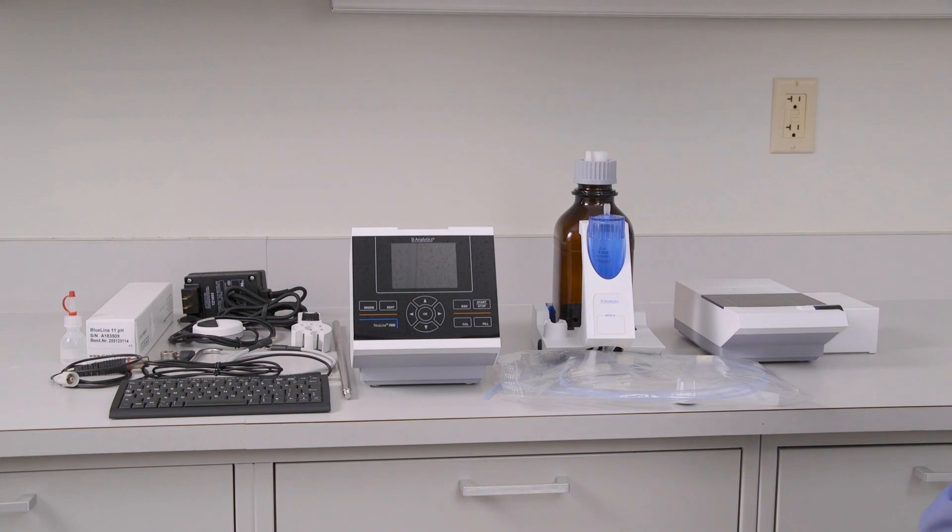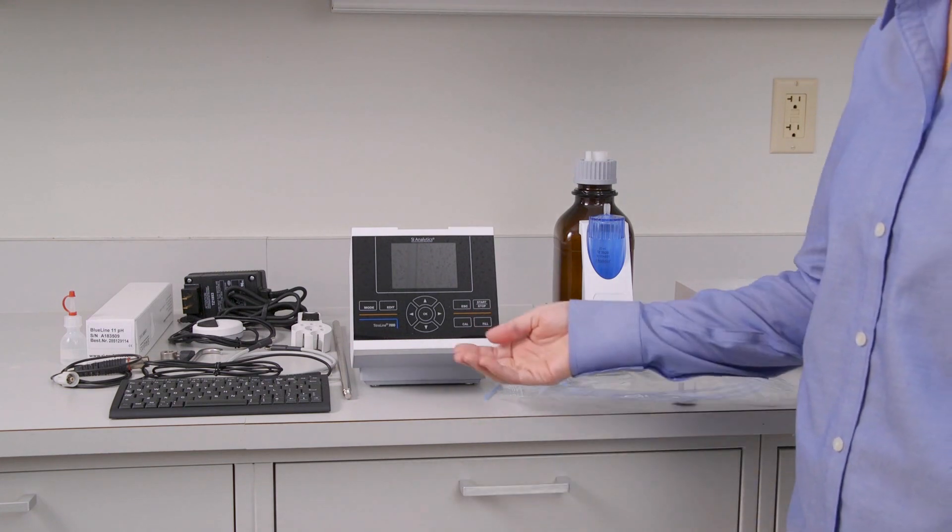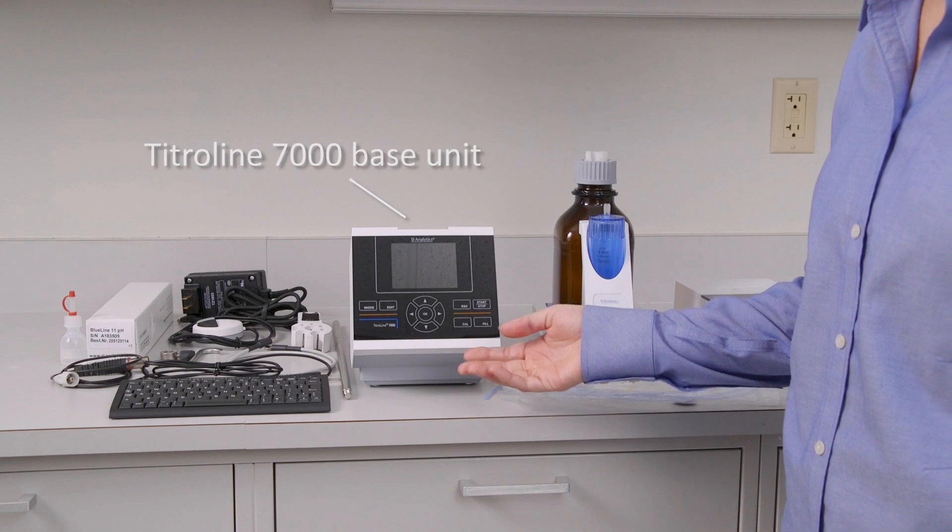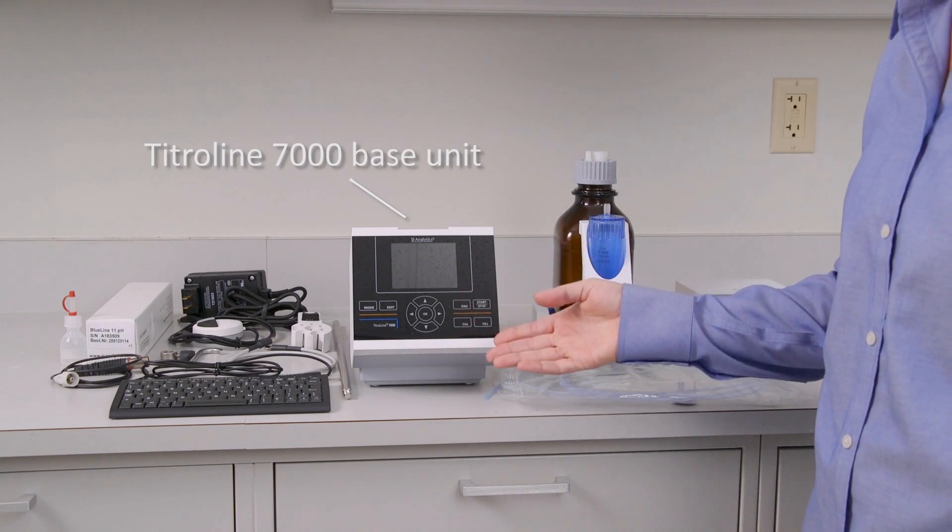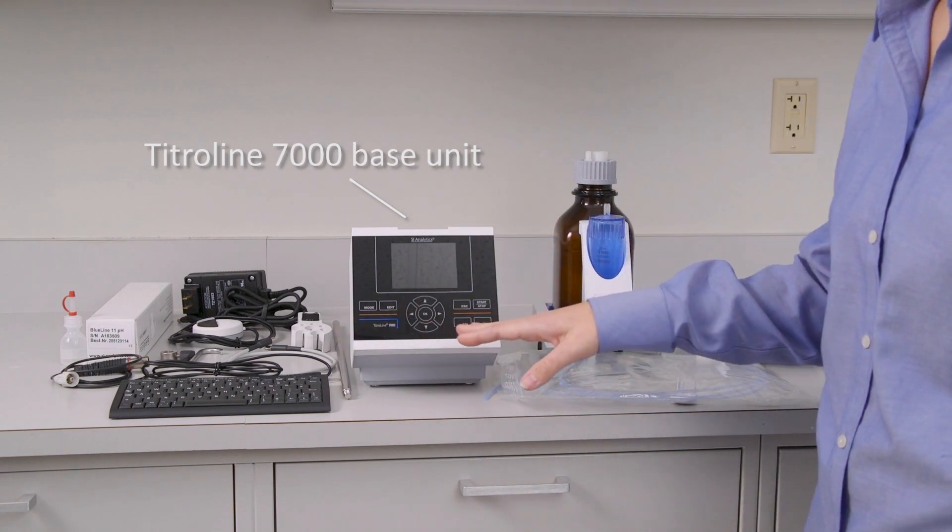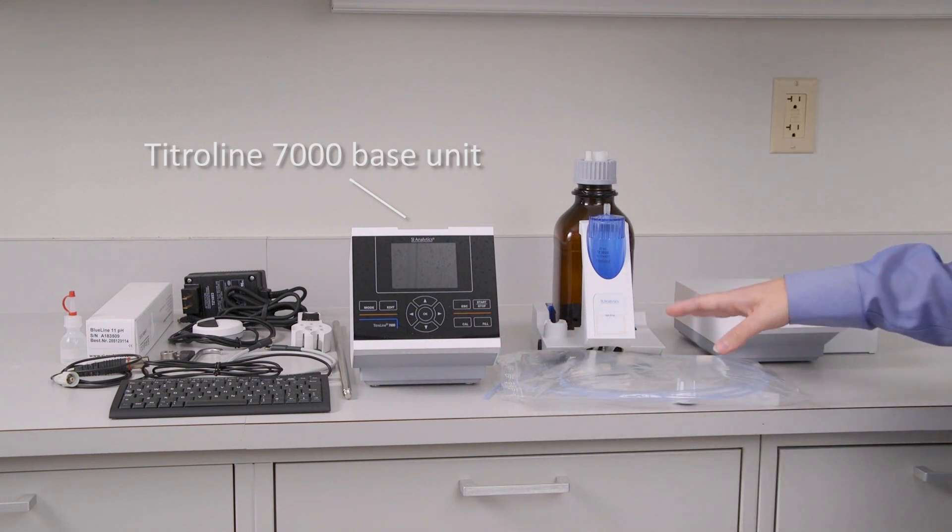We've got three main components of the system. The first one being the Titreline 7000 base unit. So this is essentially the brain of the system, and all of the accessories that you see here will come along with that.